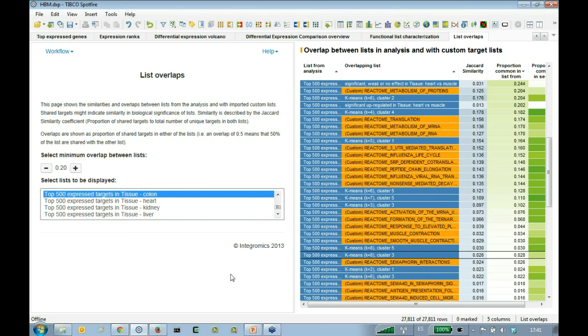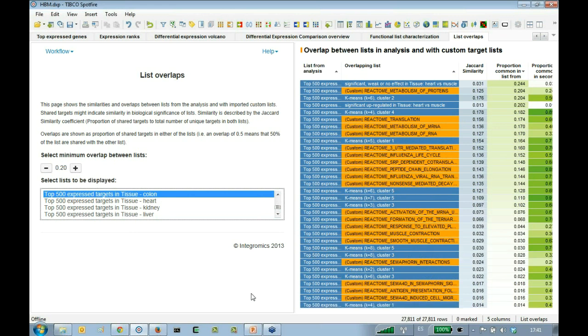So with this, I think I will conclude the demonstration. We could, of course, go deeper into any of the features that you would like to see in more detail, so please feel free to send any questions that you would like to address to the text box.